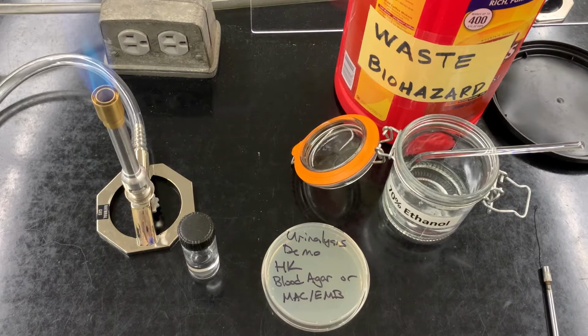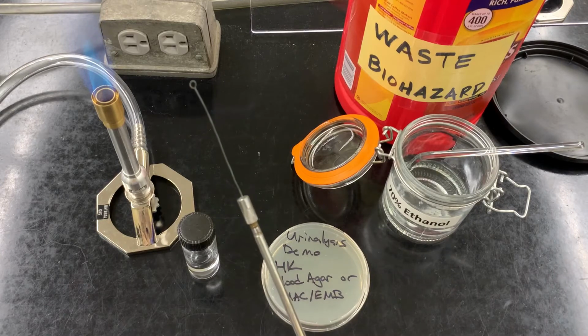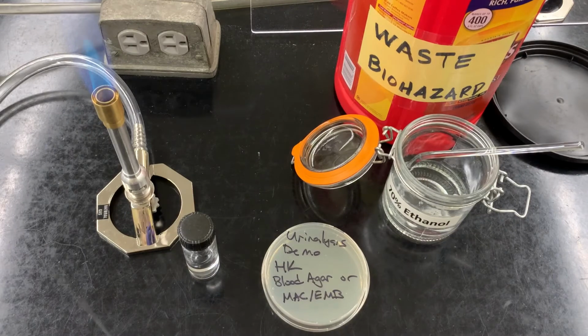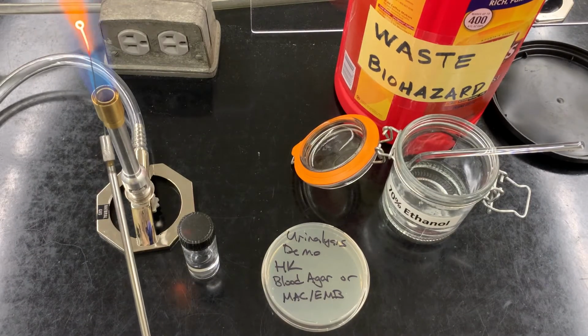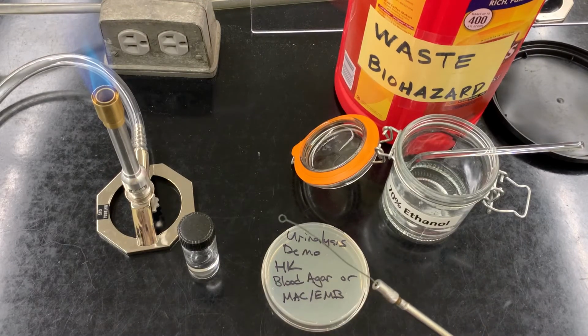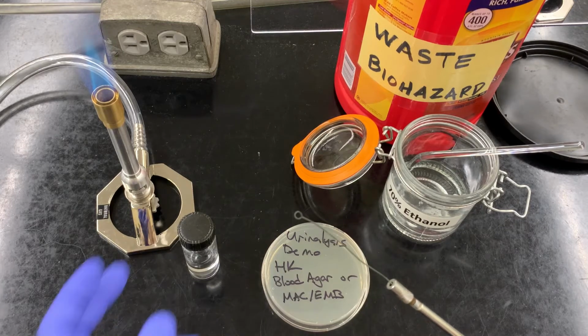And ideally, we would have a calibrated loop, which picks up a specific amount of liquid. I think it's 10 microliters that the calibrated loop normally is. But again, we don't have enough calibrated loops, so we'll just use our regular loop, and we'll call this a calibrated loop. Okay? So two ways to do this, and I'll just show you both ways, and maybe I will let you choose. But when you do it, make sure that you use the same technique for both plates, because we do want some sort of consistency.